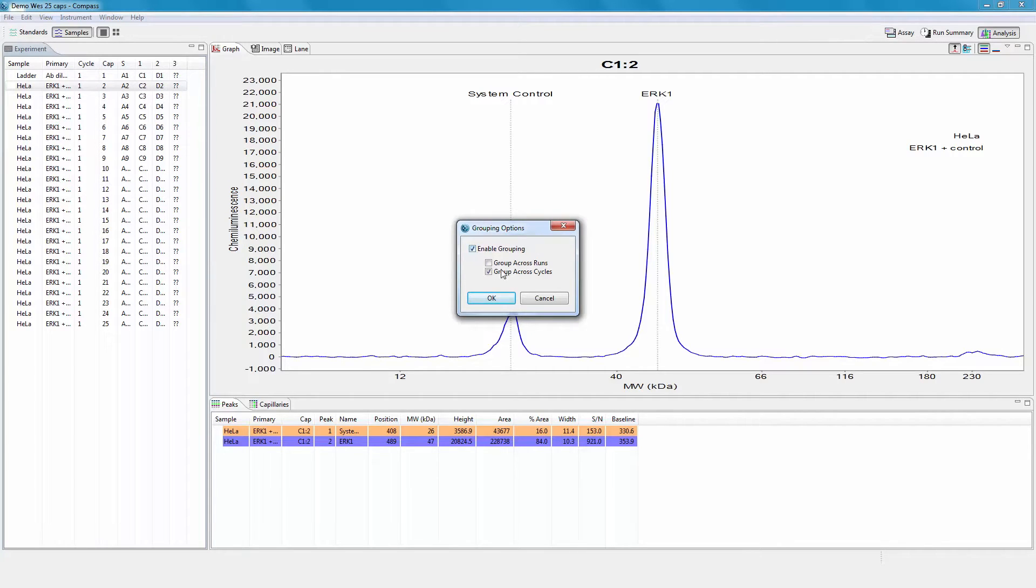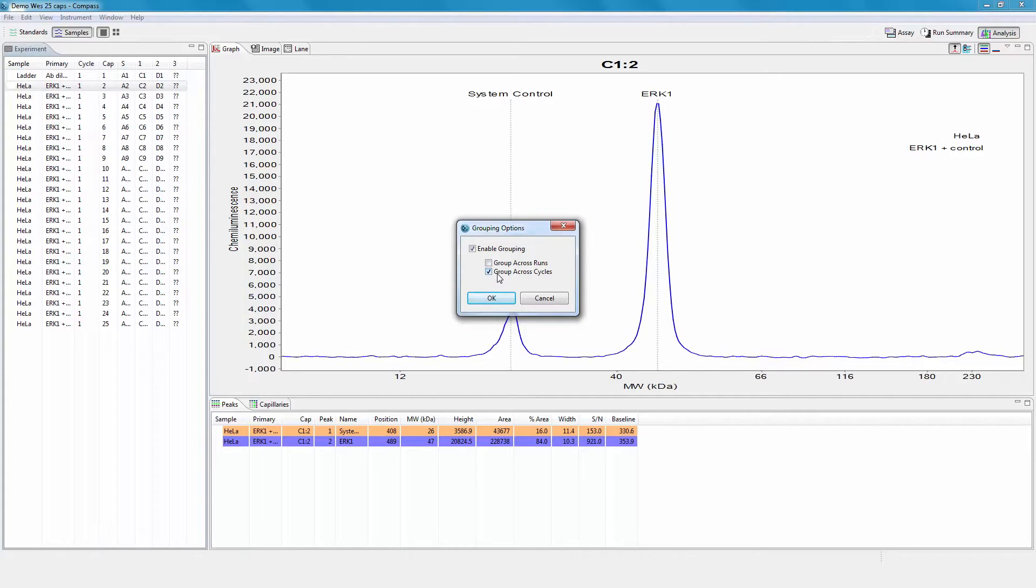Click group across runs to group capillaries from multiple runs, or group across cycles to group capillaries run in different cycles. When only one run is open, groups will only contain capillaries from the same cycle.